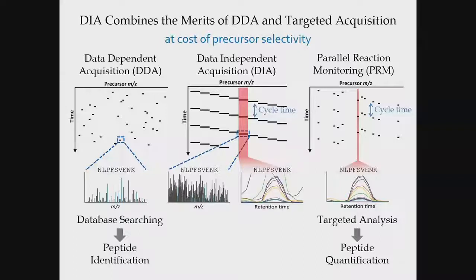A more recent alternative to this, if you want a more comprehensive sampling of the data, is, of course, to sample using data-independent acquisition. Here, what you're doing is intentionally increasing the width of the windows to multiplex the MSMS, so you're intentionally making it so you sample more things at a given point in time. Each mass spectrum is now intentionally a chimeric of multiple different components.